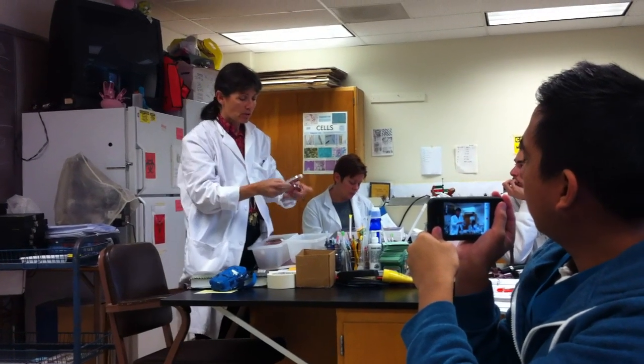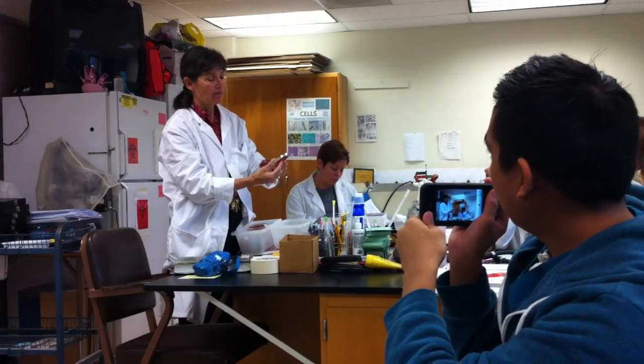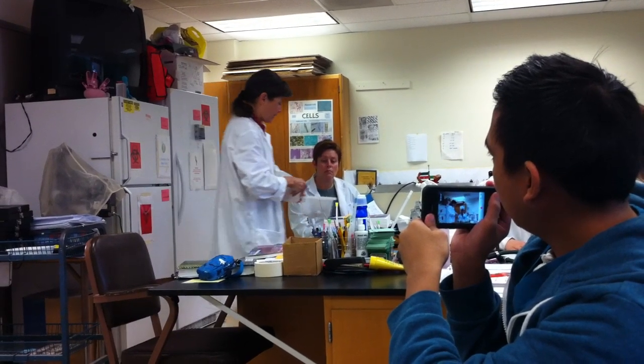You also want to notice that the colonies themselves are dark. They have a dark appearance. So let me just pass these out so you all have something to look at. And we'll probably have to end up sharing.